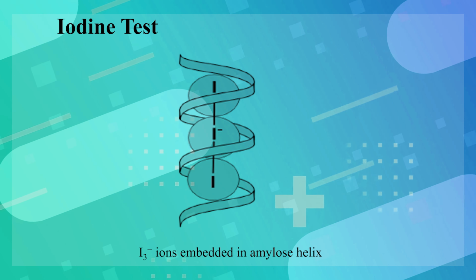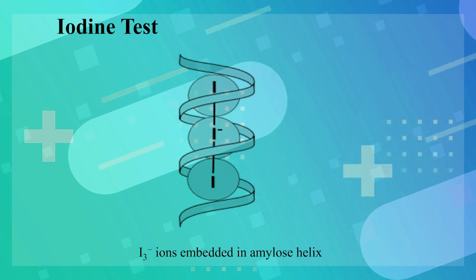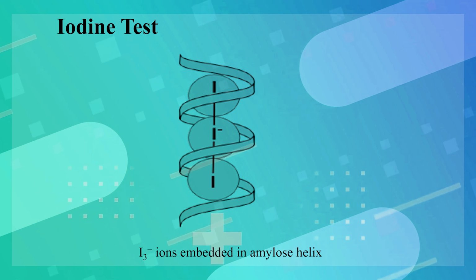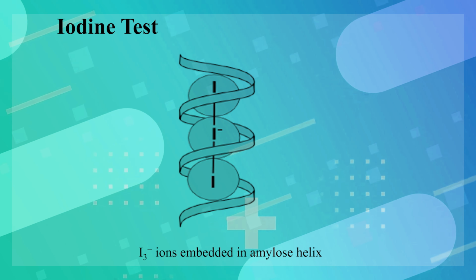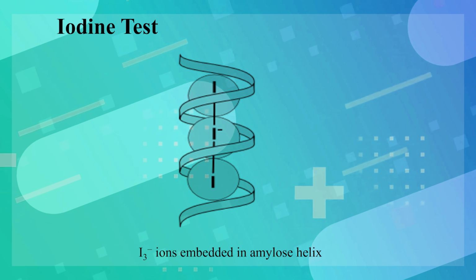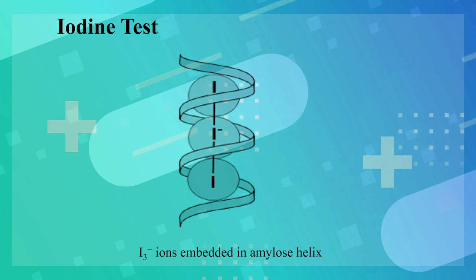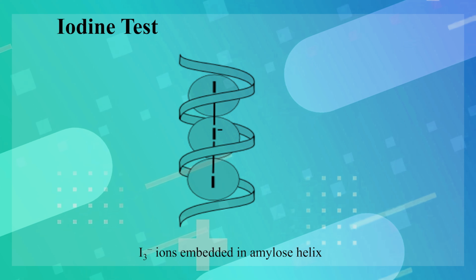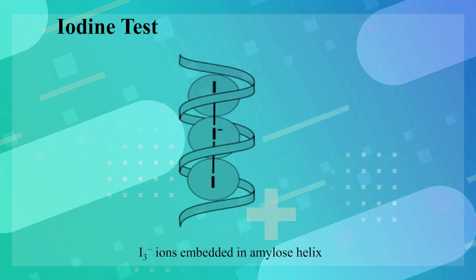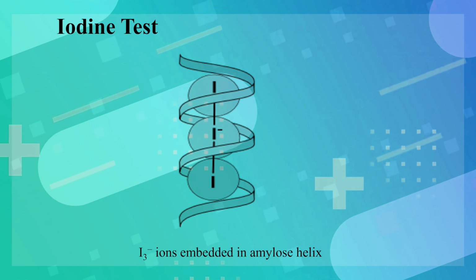The amylose fraction of starch and iodine form an inclusion complex where the linear amylose molecule will coil into a spiral in solution, which is held by hydrogen bonding between hydroxyl groups of adjacent loops, and the iodine molecules align themselves in the center of the tube formed by the spiral. This arrangement allows the interaction of the electronic orbitals of many iodine atoms, which cause the light absorption that gives the complex its characteristic deep blue color.